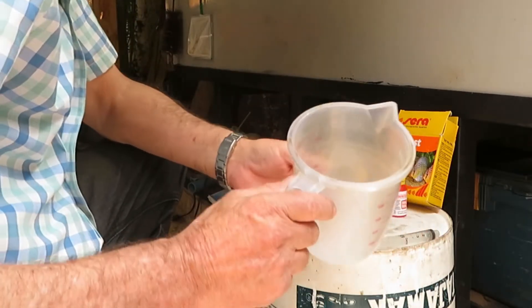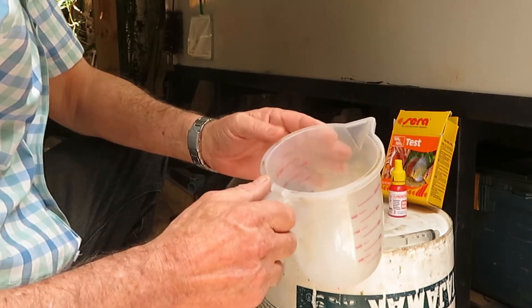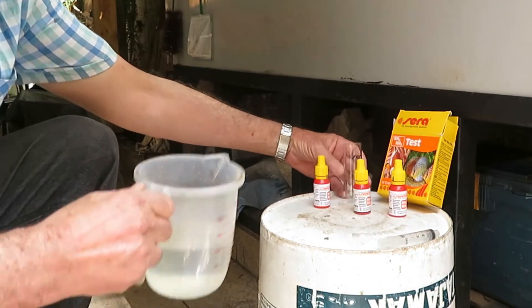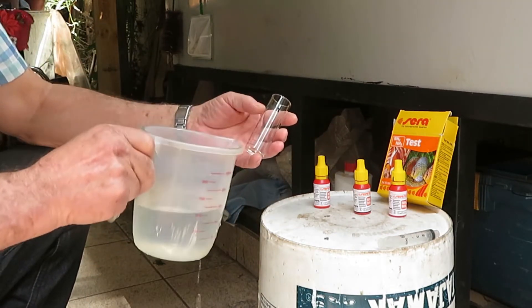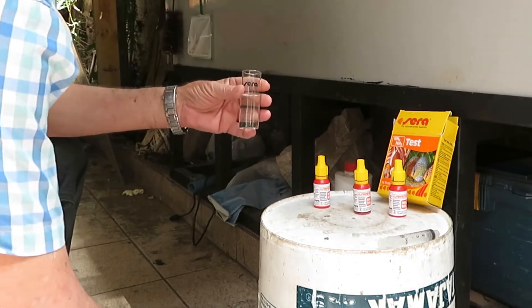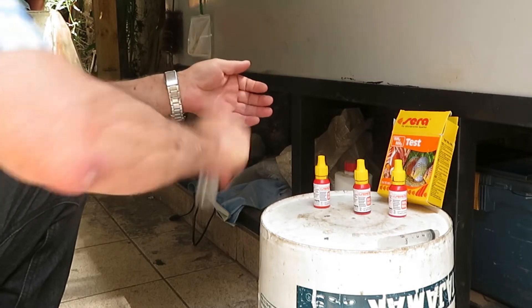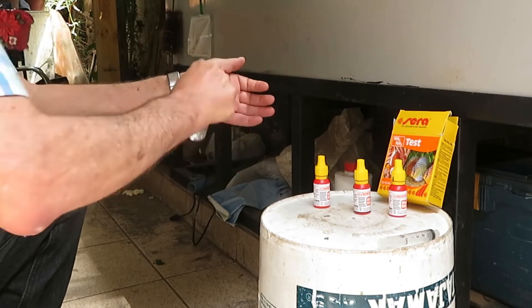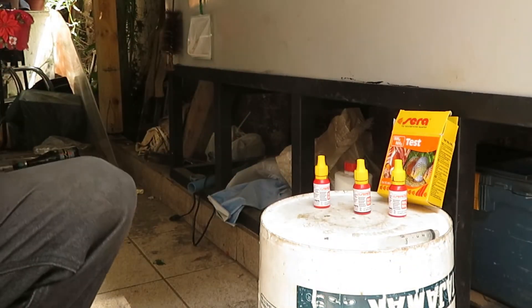The first thing we have to do is get a bit of water from our tank, pool, or aquarium, and with this water we rinse the flask we're going to use for the test. This cleans it and brings it to the proper pH, similar to the water in the tank. Then we throw away that rinse water.